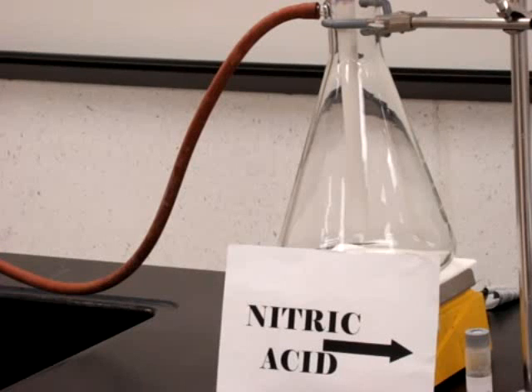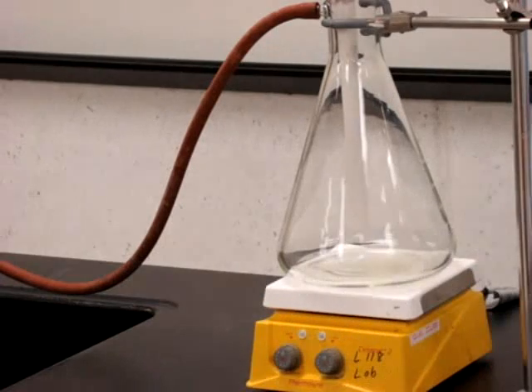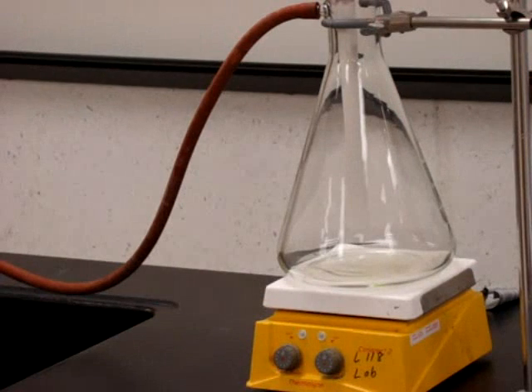Having nitric acid and copper, I had only one thing to learn, what "act upon" meant. Then the statement, "nitric acid acts upon copper," would be something more than mere words. In the interest of knowledge, I was even willing to sacrifice one of the few copper cents then in my possession. I put one of them on the table, opened the bottle marked nitric acid, poured some of the liquid on the copper, and prepared to make an observation.